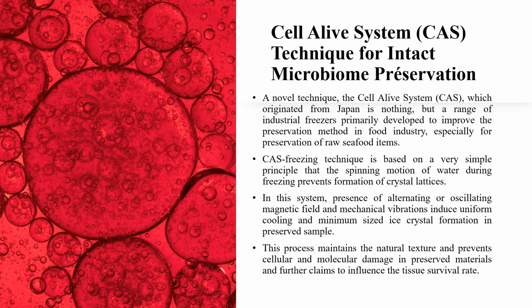What do we understand by intact samples? Intact samples are those which we collect from any environmental sites and want to preserve directly after the collection. So for that purpose, the first technique is the Cells Alive System technique for intact microbiome preservation.